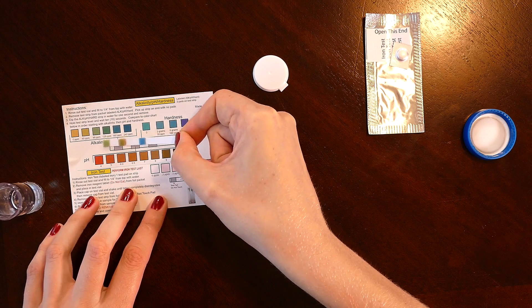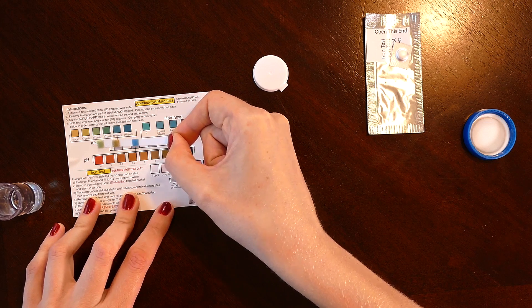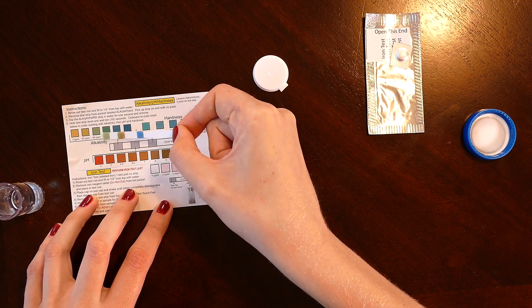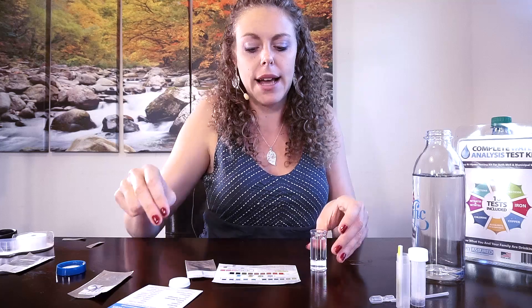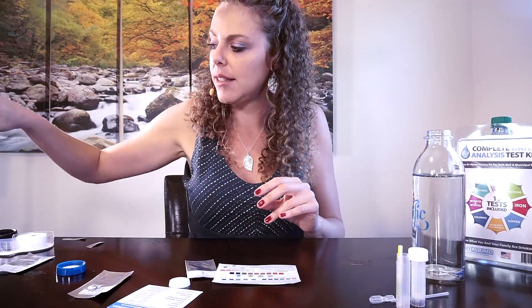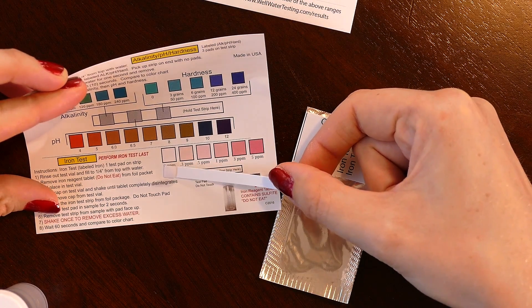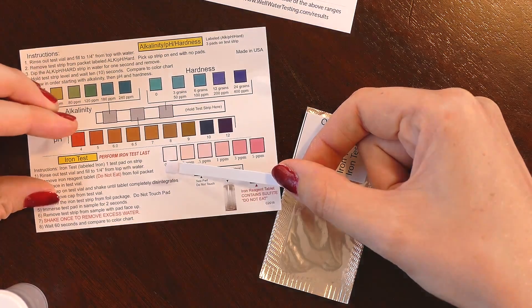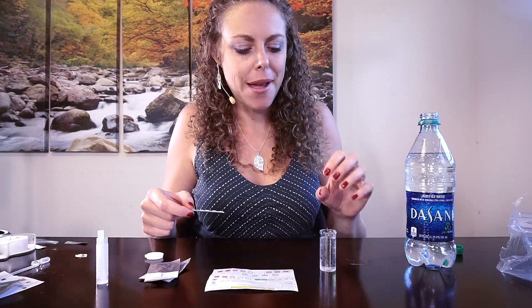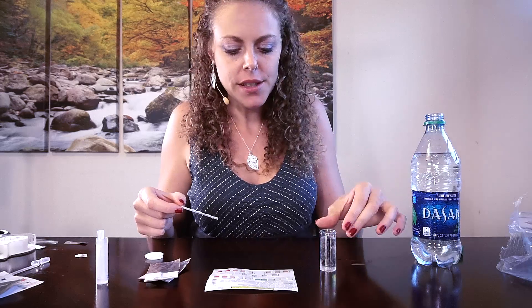On alkalinity, we're definitely closer to 80 parts per million — not quite as dark as 120, but noticeably greener than that purified water tested earlier. For the iron test, changing out the sample — it's a very pale pink, so pretty close to zero parts per million on iron. In the meantime, I'm going to go ahead and start the Dasani testing.